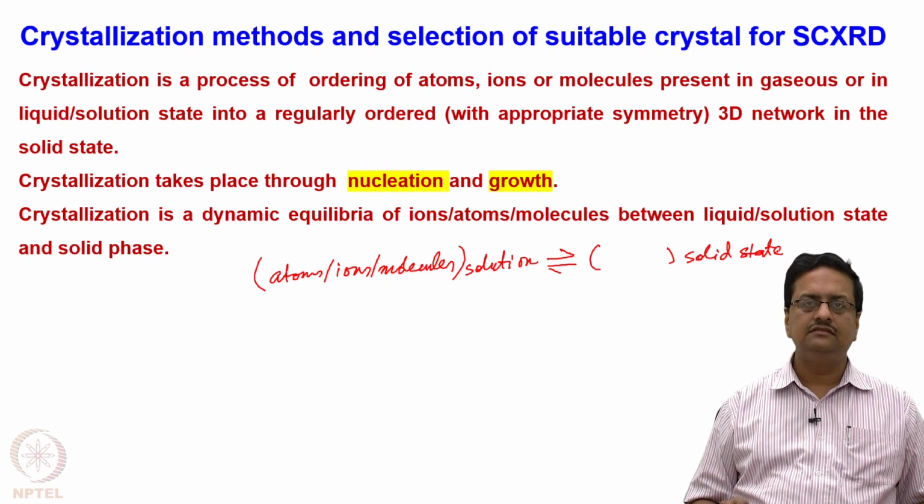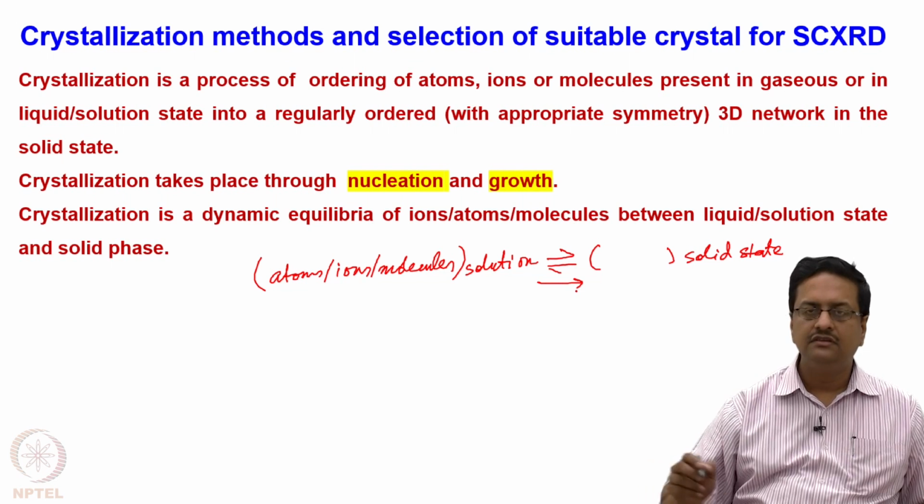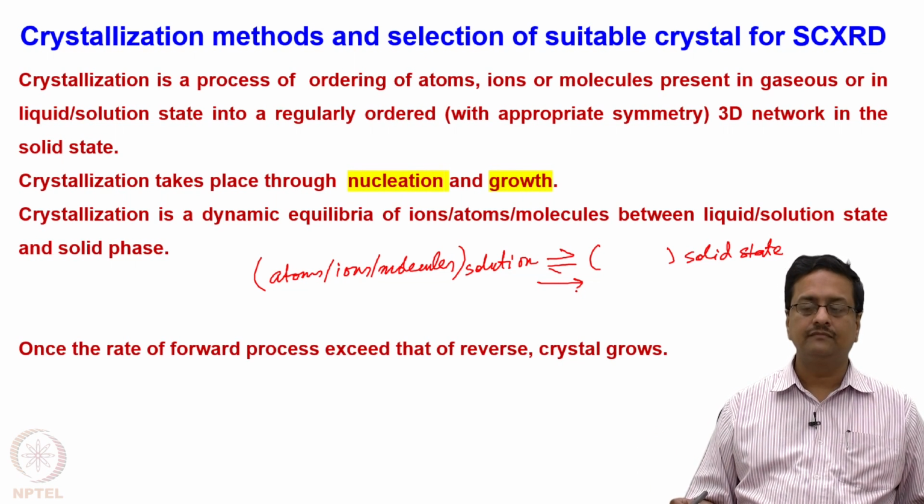And when this equilibrium shifts more towards the right, then we end up getting the crystal growth.